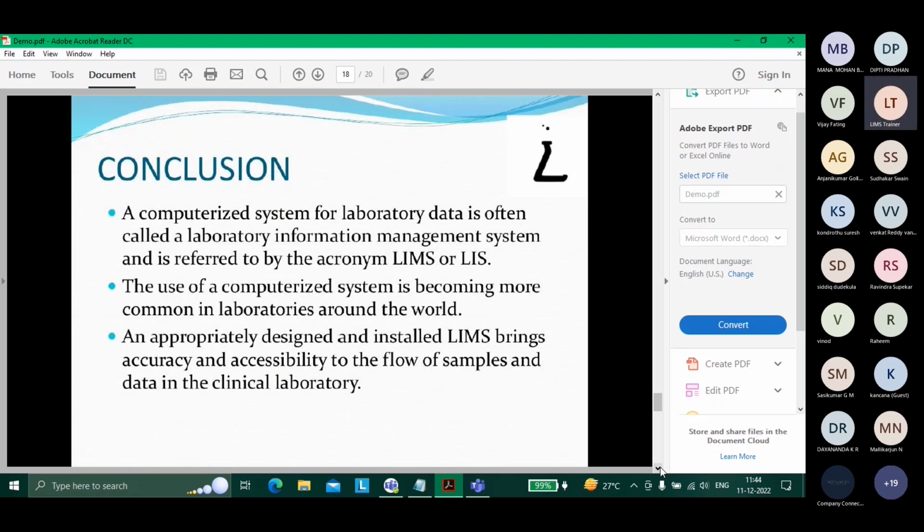So, coming to the conclusion, this is what LIMS is. Going ahead in our future modules, we'll be discussing Labby LIMS modules. Maybe I'll touch a bit on the table structure of Labby LIMS, some basic LIMS codes, and a bit about queries, which queries are mostly used in Labby LIMS. Maybe we can touch a bit on workflows, static data creation, analysis, the sample table, and result table variation. We'll touch everything one by one.